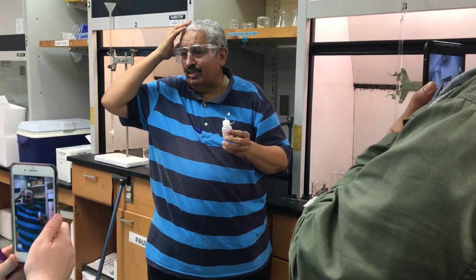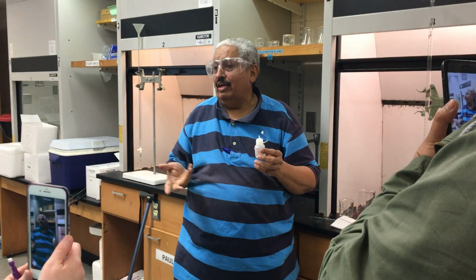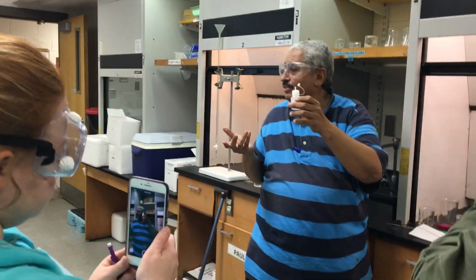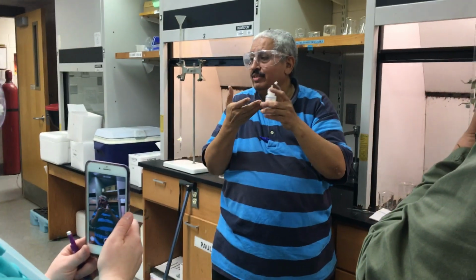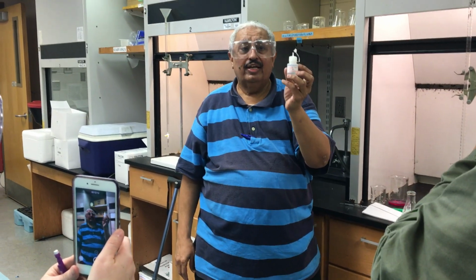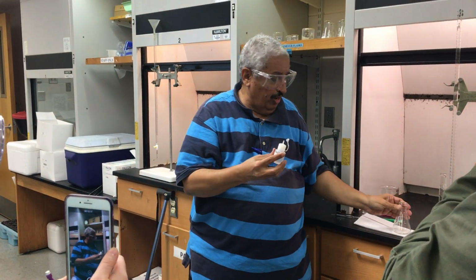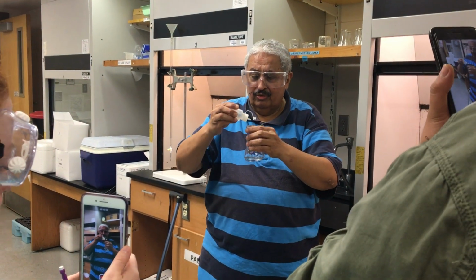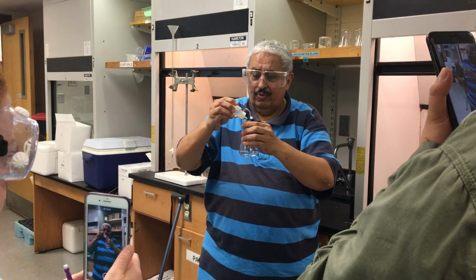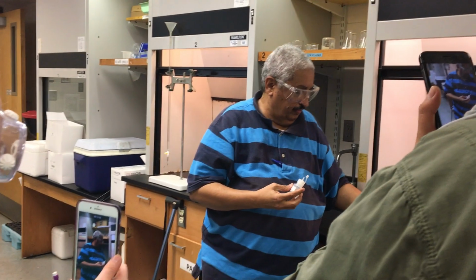If you have an acid, you get a color. If you have a base, the organic dye will give another color, correct? Organic dyes are really indicators in general. So they change their color according to the medium they are in, whether acidic or basic. So I'll put how many? 3 drops. 1, 2, 3.